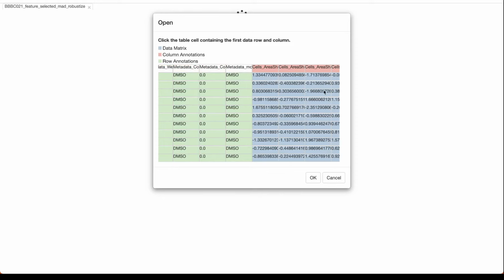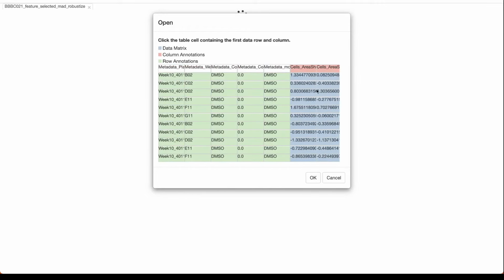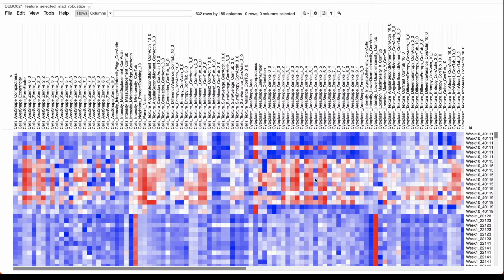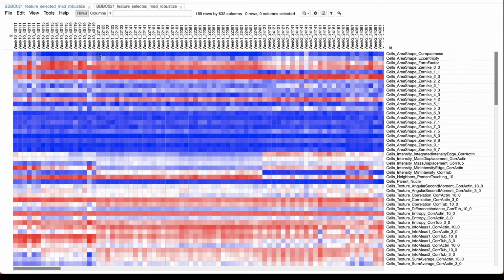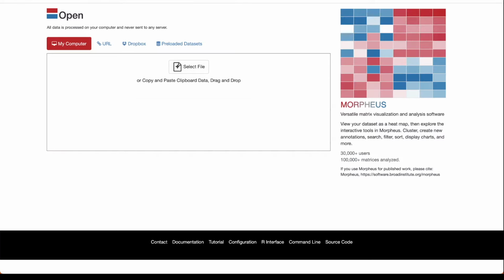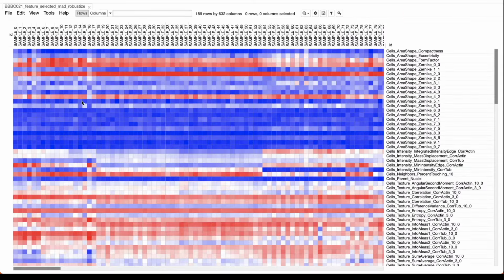And so if I have metadata columns in here, it's very difficult to then sort of get them back out. And so you want to rearrange your columns. It definitely works to import them though, although compared to everything I'm about to show you where we start from a GCT file, if you want to do things the same way here, you'll need to go to this Tools menu and hit Transpose so that you have columns that are wells and rows that are features. Typically though, we just start from GCT files instead, which are made in that same Jupyter notebook that I demonstrated.